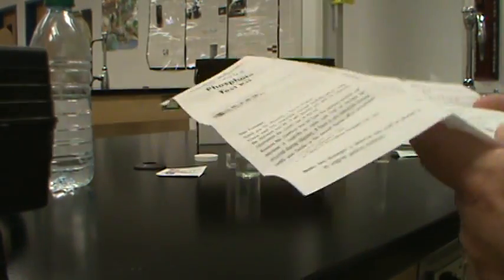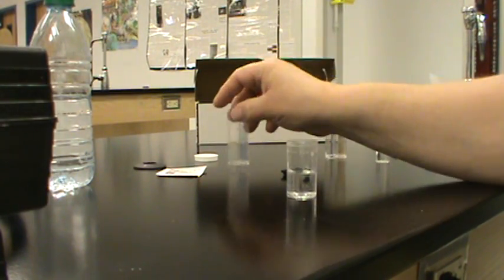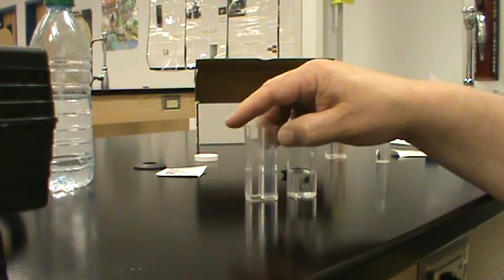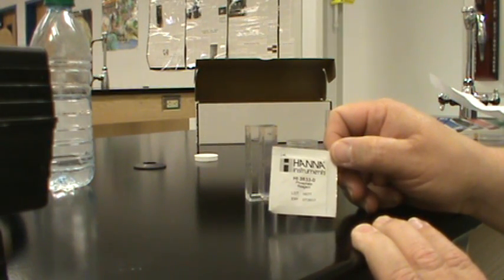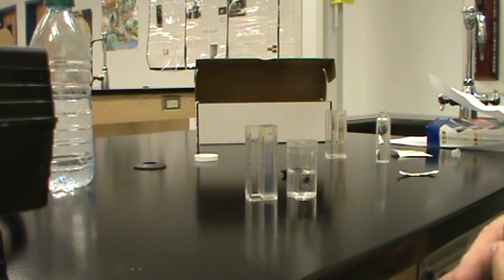So here's what we've done. This is a very simple test to do. We've taken 10 milliliters of water. We have what is called a comparator. As you can see here, on one side it's colored and on the other side it's clear. This is where we're going to pour the water in. We take one of our phosphate reagent pillows, and reagent means it reacts with the phosphates in the water. Teachers, if you're watching this and want to try this, please make sure that you have determined if your students can read and follow instructions.